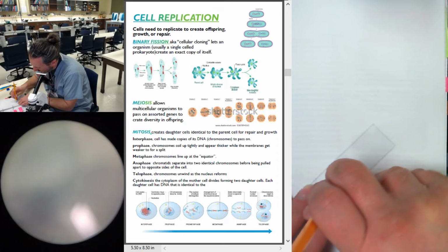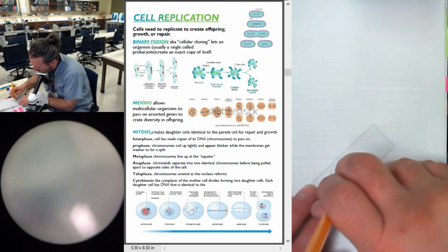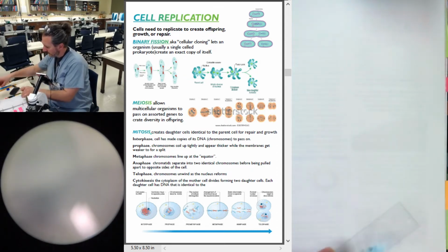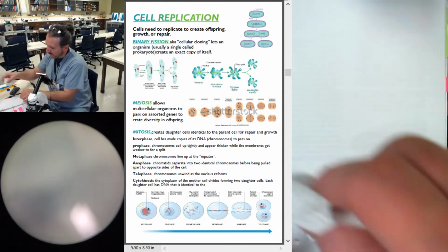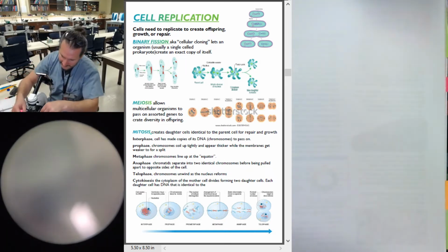These guys are holding it up. Smush. So I'm going to slide this down, give another smush. I don't want to get a mess. Blot up the excess here. Put it back under my scanning.